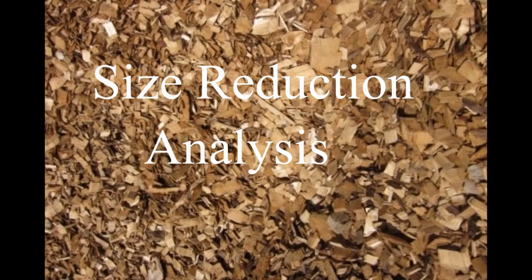In this lab, particle size analysis will be done using a similar technique to microscope counting, except instead of a microscope, we will be using a scanner and ImageJ software to analyze different particulate matter. Next, let's move on to the setup of the lab.